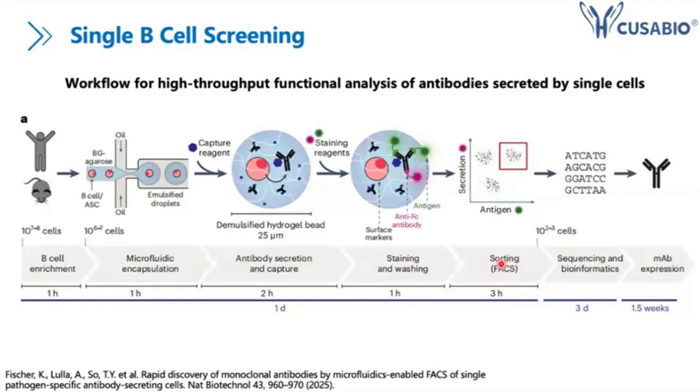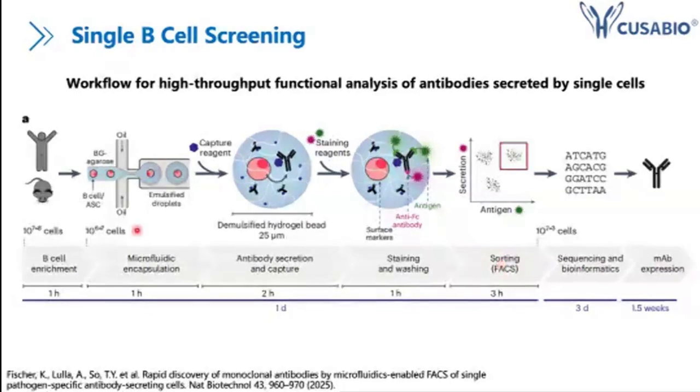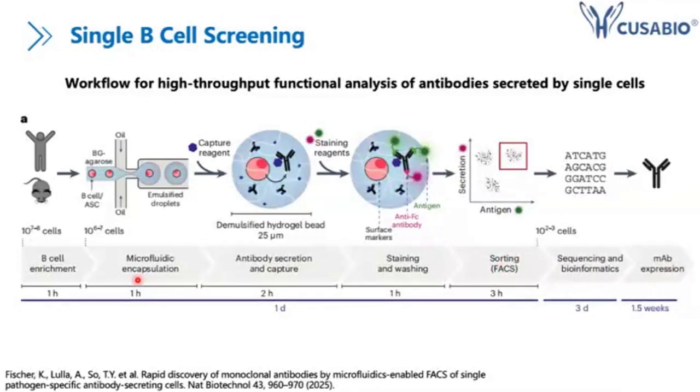to get the target antibody. And for the microfluidic chamber-based culture, for this one, we rely on cell screening for antibodies. So the single cells that are secreting antibodies will be isolated and cultured. With these cells, we still do gene amplification and recombinant expression, followed by validations to get the ones that we want.